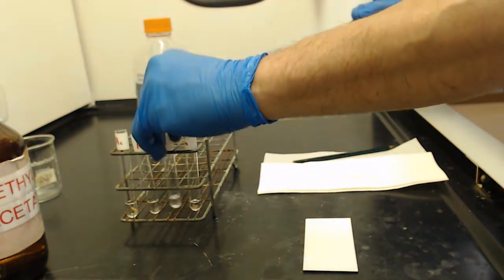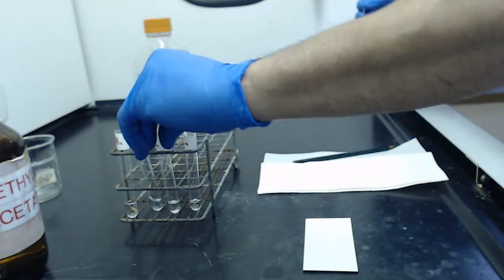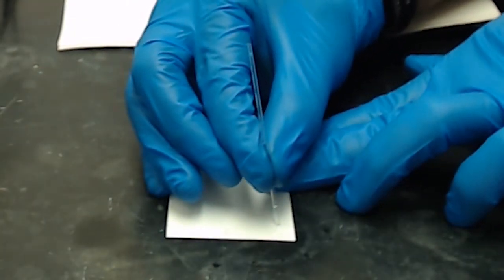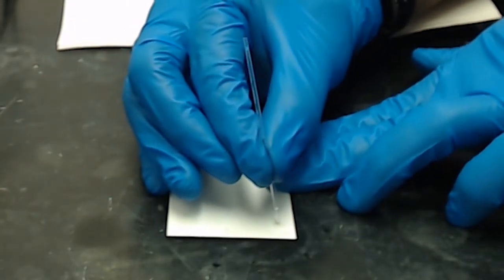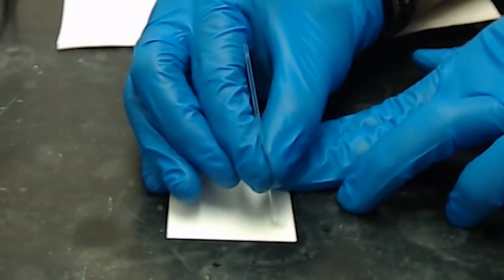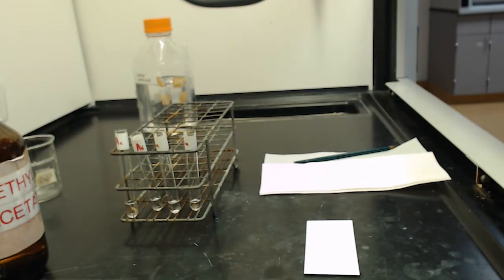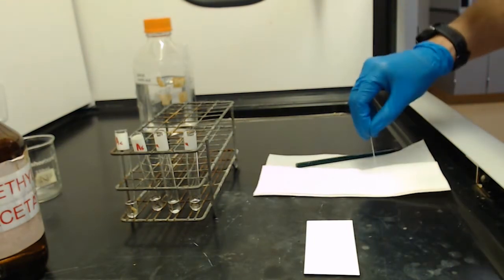Just get a little bit up in there. Just got to touch it onto the liquid and then it sucks up on its own by capillary action. So, just a little bit. Okay, that spot came out kind of big. Hopefully you guys can see that on the camera, but that spot is a little too big. It'll be okay for today's experiment though. It worked just fine regardless.